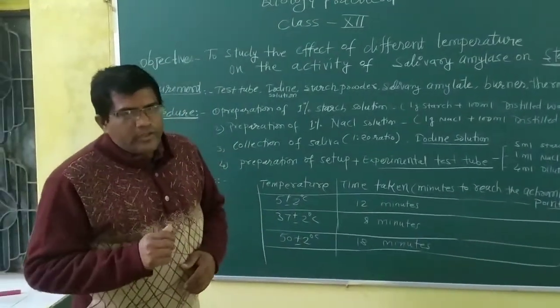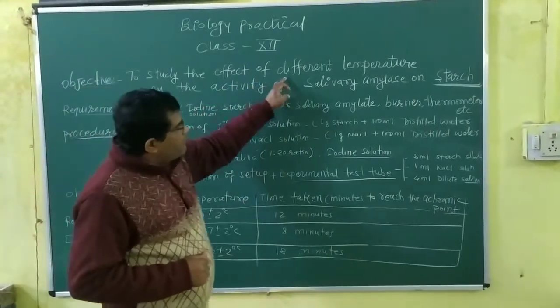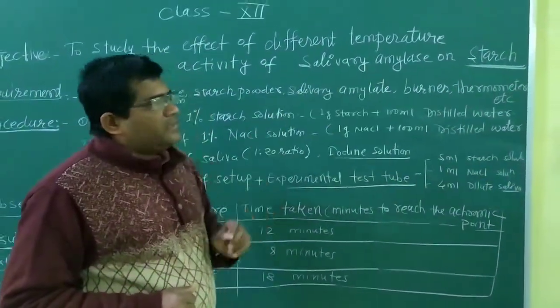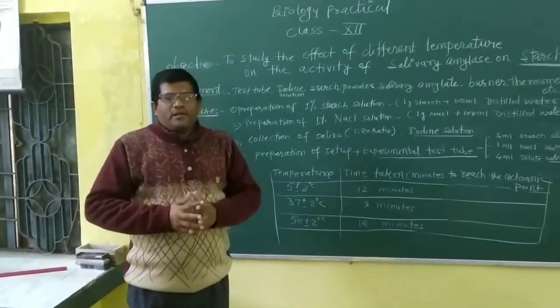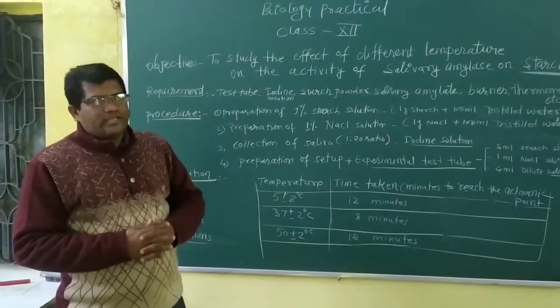And today the practical aim is to study the effect of different temperature on the activity of salivary amylase on starch. So this is a very good experiment, children, and a practical board examination of the CBSE class 12th examination. This is a major experiment.